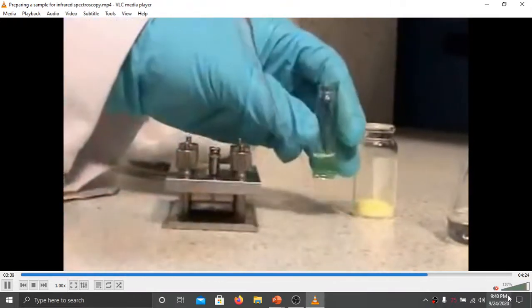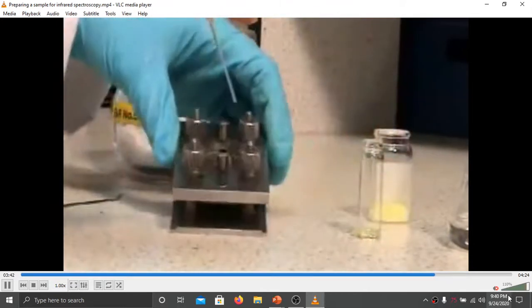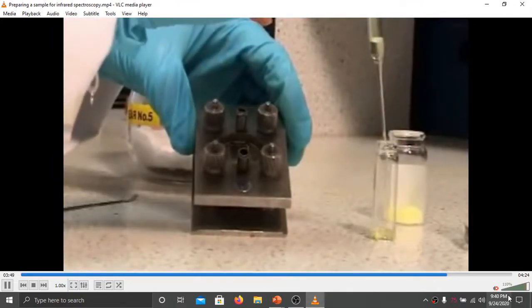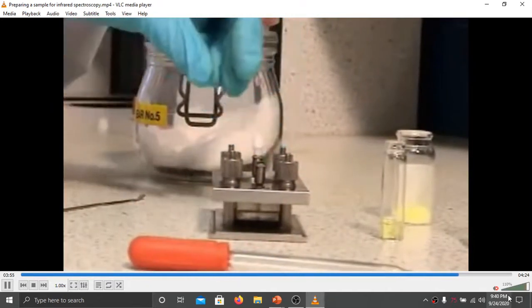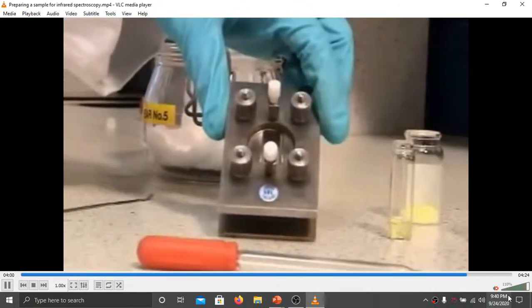Now we will place the liquid with the dropper from the lower end of the tube so that it will flow through the cell, removing any air bubble trapped between. Care is to be taken that there is no entrapment of any air bubble. The liquid is allowed to come out from the other end. Now Teflon or plastic closures are used to close these tubes.